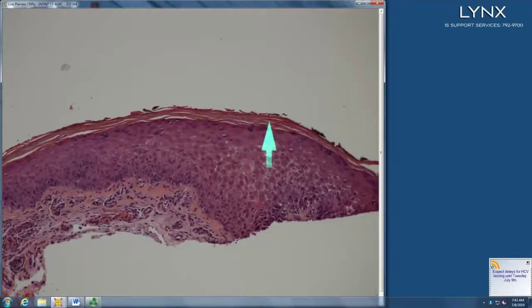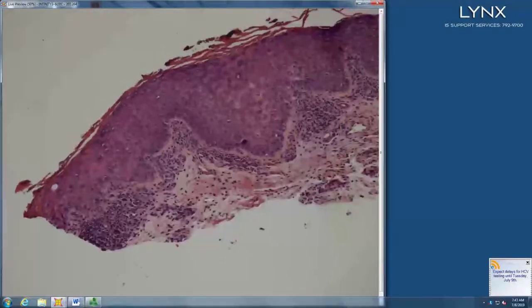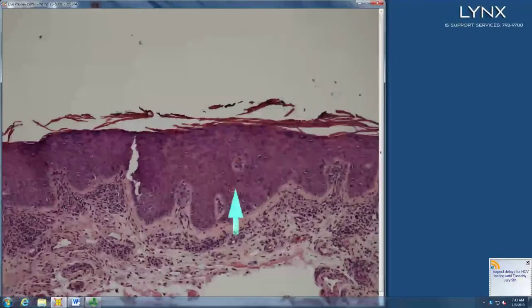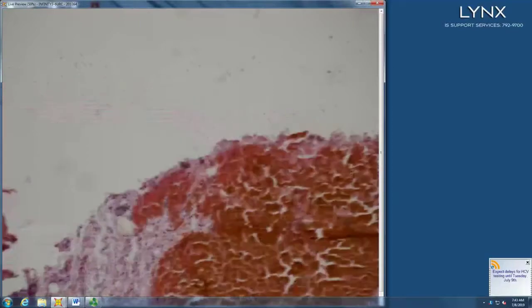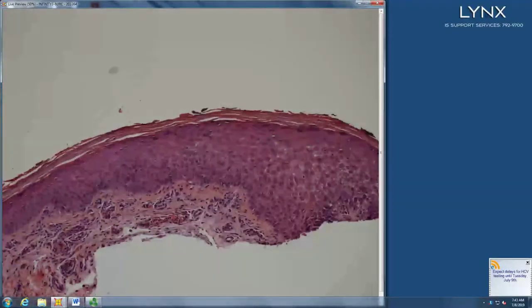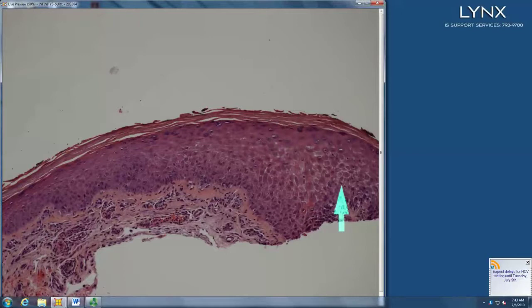With parakeratosis. Tell me about your basal layer. There's some dead reds in there. Is it more spongiotic or more interface with the dead reds? Actually more interface. It has a compact corneum with parakeratosis. And what's that binucleate red thing in there? A little EO. Eosinophil. So you've got an interface dermatitis with EOs and parakeratosis.